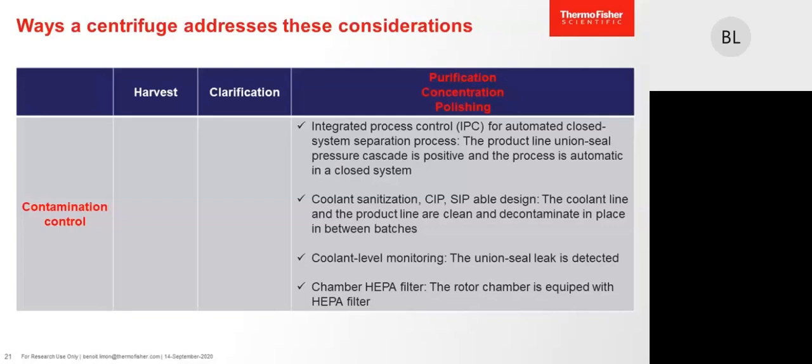Of course, be careful with the coolant, sanitization, the clean in place, the steam in place ability of the design to ensure all the lines are clean and free of contaminants, and monitoring the level of the different liquid and coolant lubricants to ensure no leakage and to be able to prevent it, and the possibility to use some HEPA filter between the chamber of the centrifuge and the outside of the centrifuge.